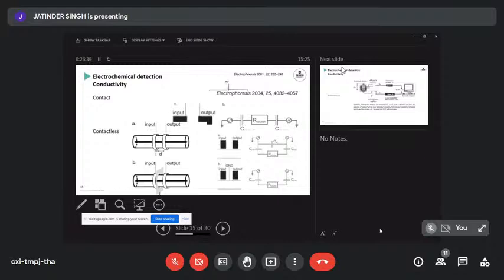And then we can measure, with a lock-in amplifier, the AC signal coming through the solution into our output electrode. Doing a whole range of signal processing allows us to get back to what the resistance of the solution is. If we get different analytes coming through our detector cell, we can measure that difference in resistance.